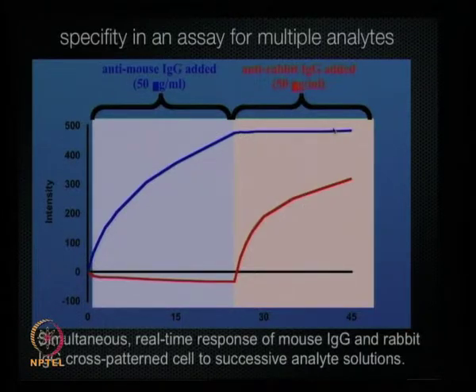So actually, you need to show the specificity of the assay, and to test it out, you have probably immobilized different types of proteins. That's right, one from rabbit, one from mouse. Yes. And now when you're looking at how specific the signals are, only anti-mouse is binding on the feature where we have the mouse IgG. That's correct. And the one where we have the anti-rabbit IgG, it's only binding with the rabbit IgG. That's right. And this is showing it with two.